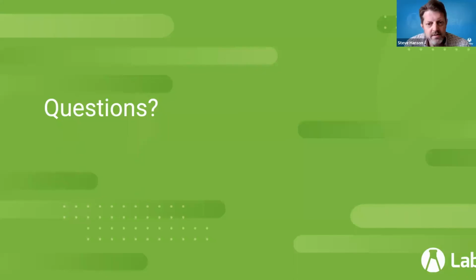Great. Oh, and another one. It's interesting. A user asks, any future plans to integrate a Jupyter interface? That's interesting, because we are doing some work for Jupyter, mostly through the reporting mechanism. But I'd love to hear, and I'm sure others would love to hear, what that would look like.